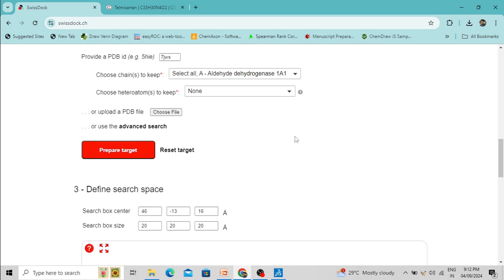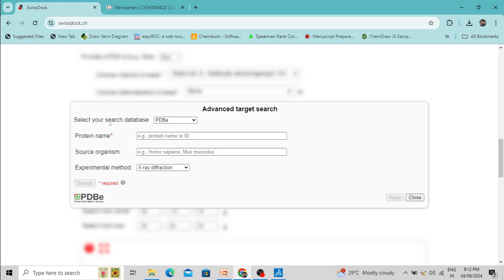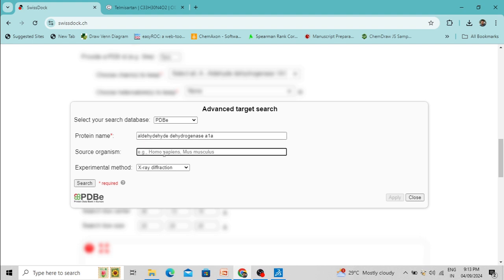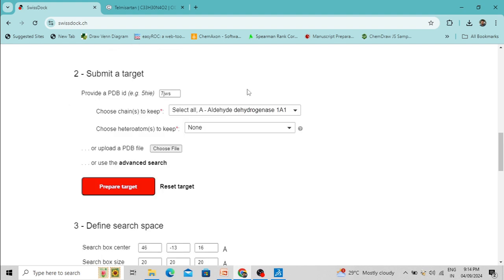You can also simply upload your PDB file directly if you have downloaded the structure from any database — it should be in PDB format. Or you can use the advanced search to search the PDB RCSB database and type the name of your protein, such as Aldehyde Dehydrogenase 1A1, from Homo sapiens. Several options will appear.